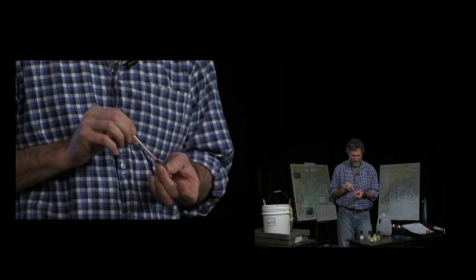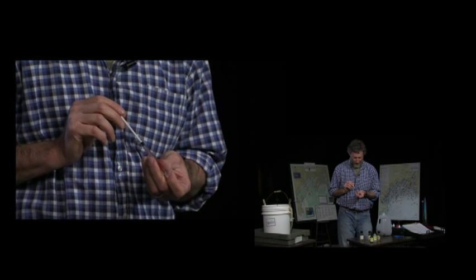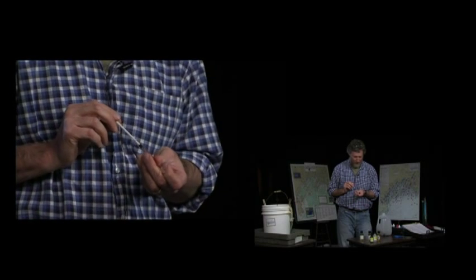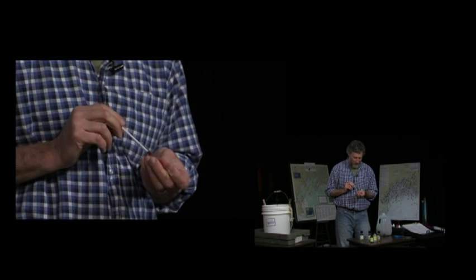We're going to fill this titrator up with some sodium thiosulfate. And this is our measuring tool. This is how we'll be able to measure how much oxygen is in the water.